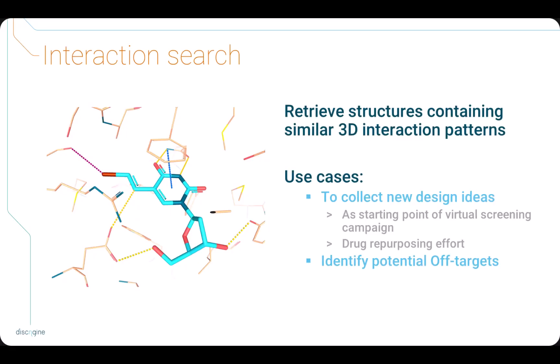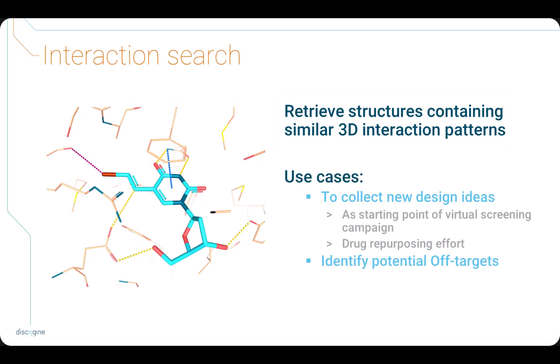In this video tutorial, we will use the 3Decision Interaction Search, which finds structures with similar protein-ligand interaction patterns from a determined query. This feature can be used for several use cases. In this video, we will show an example of drug repurposing.